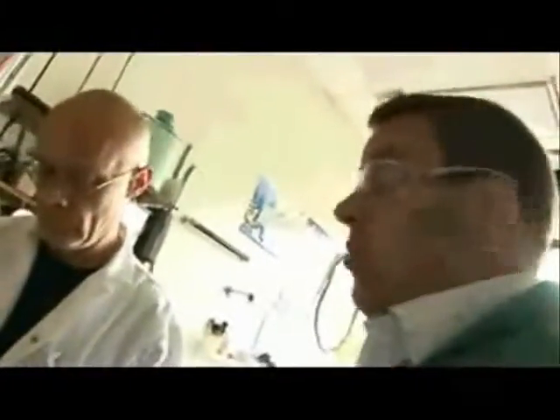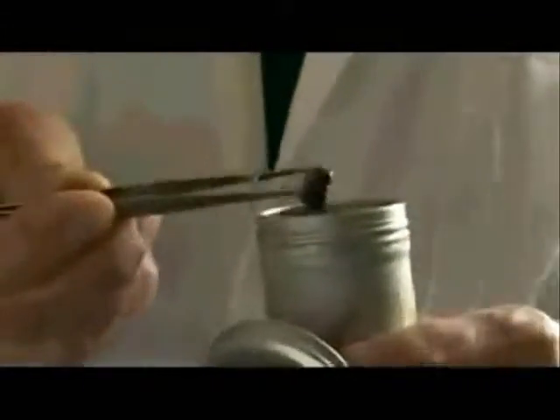So it's lithium. Lithium's the top of the alkali metals, lightest of all of them. It's very, very reactive. We use it a lot in organic chemistry to activate carbon-carbon bond formation. But you can see here it's a very, very dark coloured metal. It's actually really nice and shiny if you cut it fresh, but it reacts with nitrogen in the air to form lithium nitride really, really quite quickly.